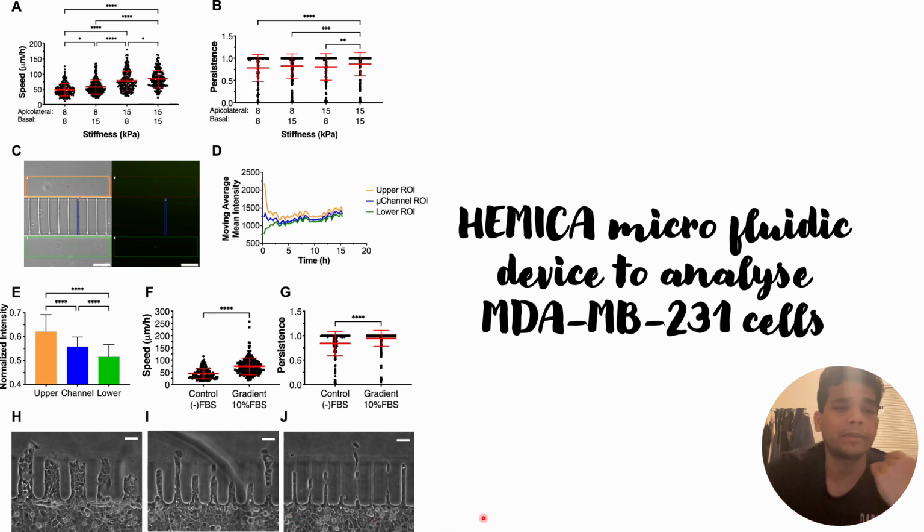So this provides us the information about how this width can be used to control and customize based on the experiment need, whether one needs to check the single cell movement or the whole cell or high throughput cell movement.